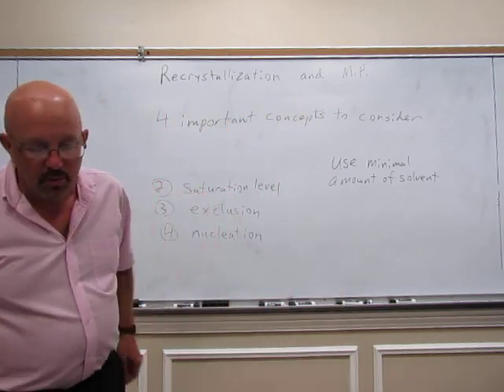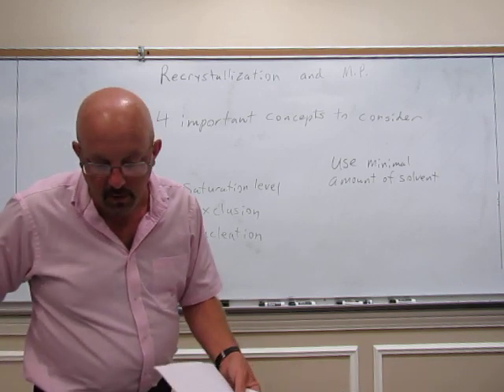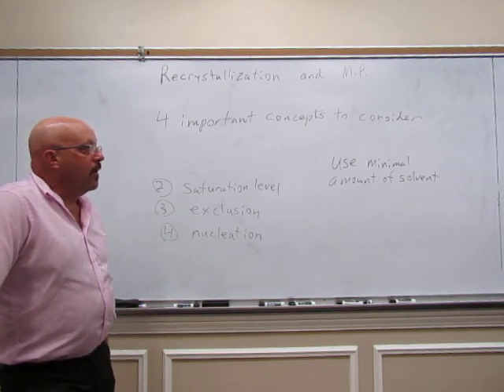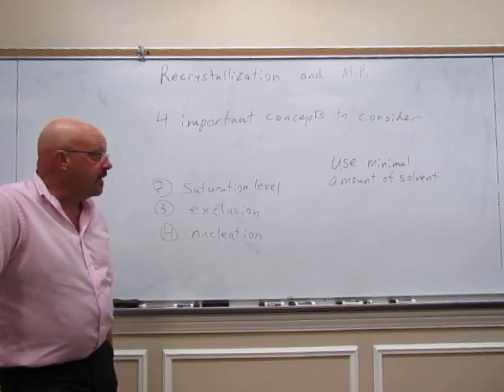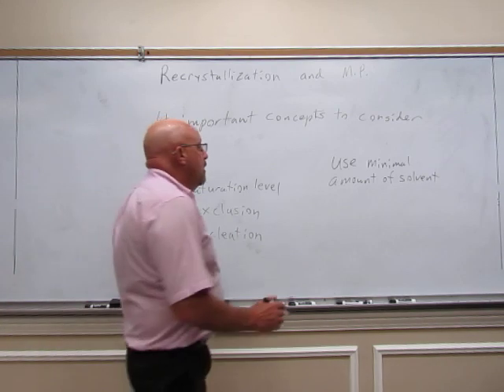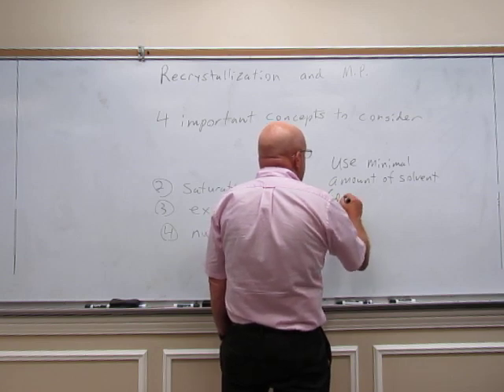If you look in your procedure, I'm certain it will say, I haven't looked at it for a while, use a minimal amount of solvent. And everyone always asks me, well, how much is that? I don't know. The smallest amount that will dissolve your compound at boiling. That's the minimal amount. You want it to dissolve the solute at boiling.